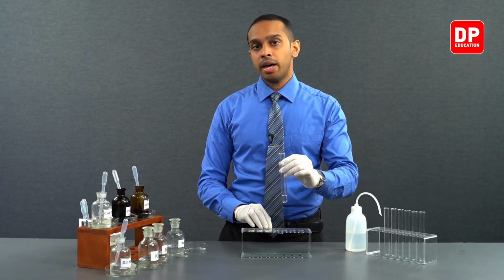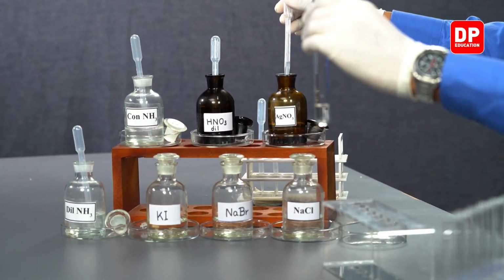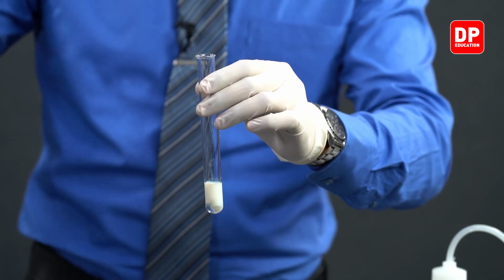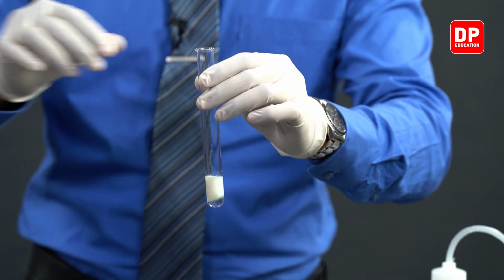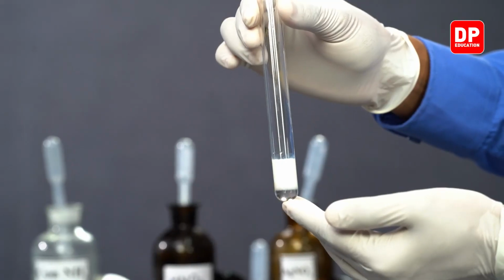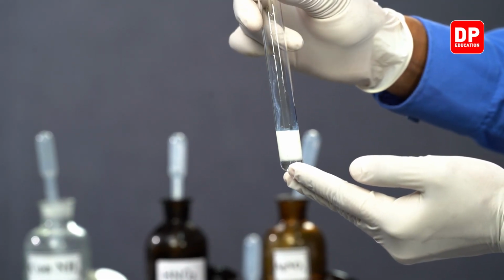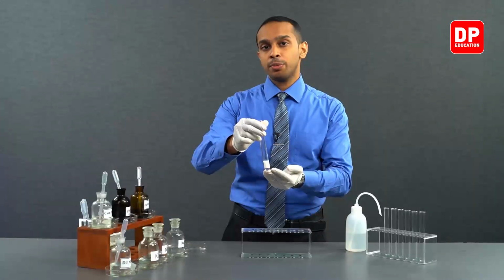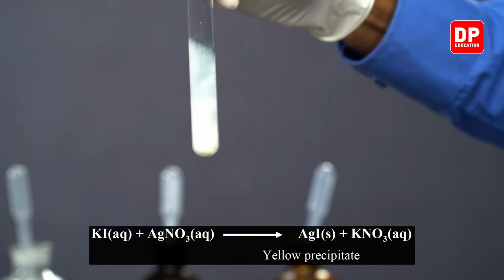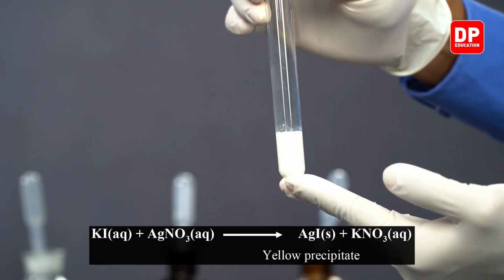And then we will add a little bit of silver nitrate to this test tube to see what changes take place. As you can see, upon addition of a little bit of silver nitrate into potassium iodide solution, we are starting to form a slight yellow color precipitate. This precipitate is silver iodide. So let me give it a little swirl. You can see a yellow color precipitate forming.